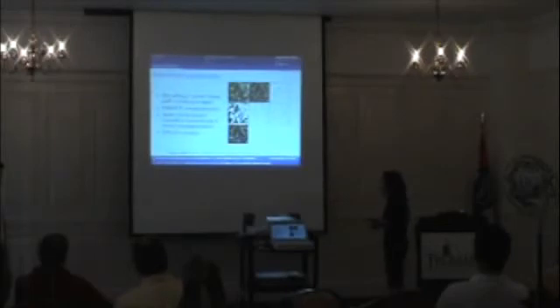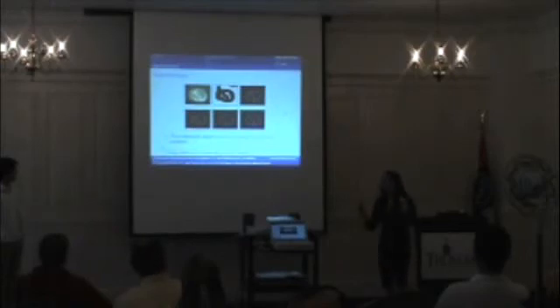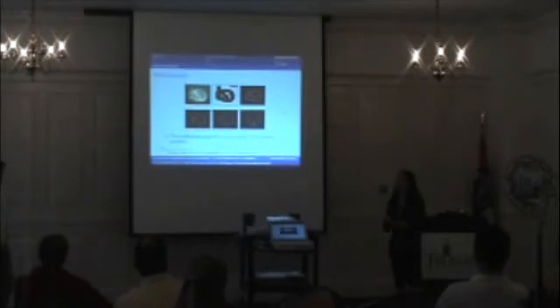The problem with watershed segmentation is that the results are difficult to smooth. The images are kind of noisy, a little bouncy. It's not a great curve. To fix this, we use something called water snakes. Everybody should get really excited, because water snakes take the watershed algorithm and add in ideas from level sets, mainly this idea of adding an energy equation, so we have a regularization term that creates smooth boundaries.